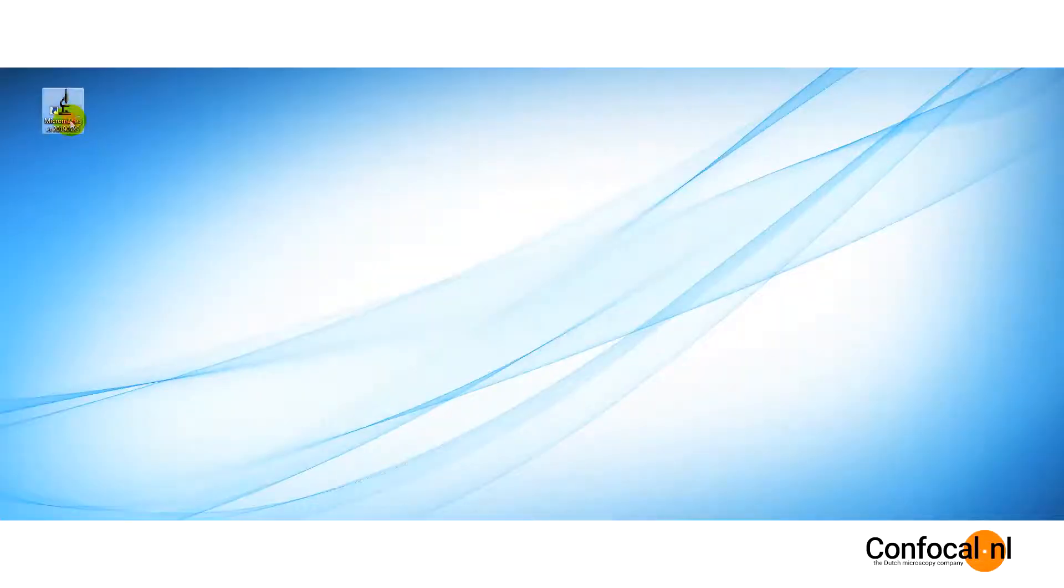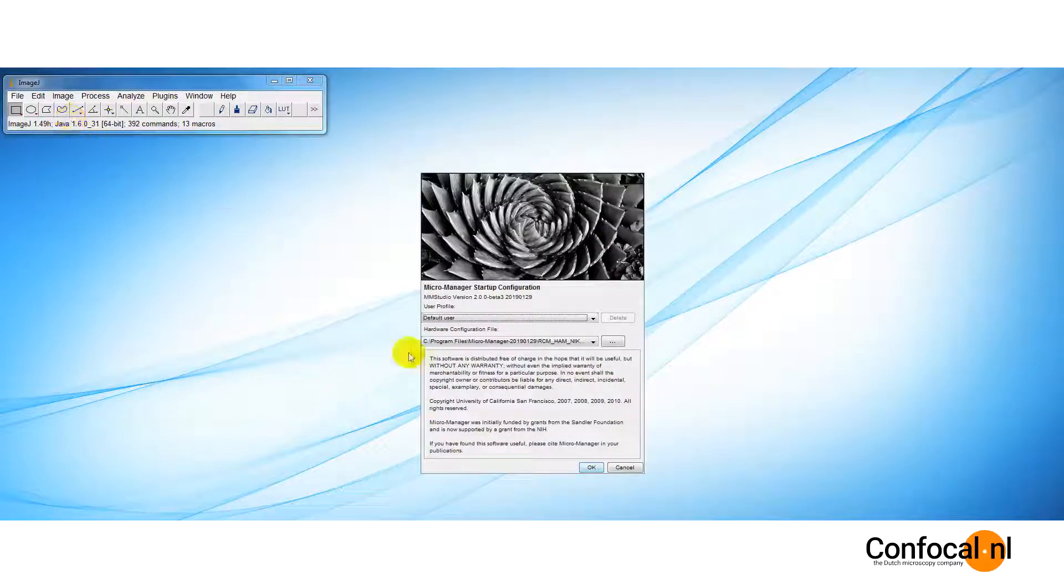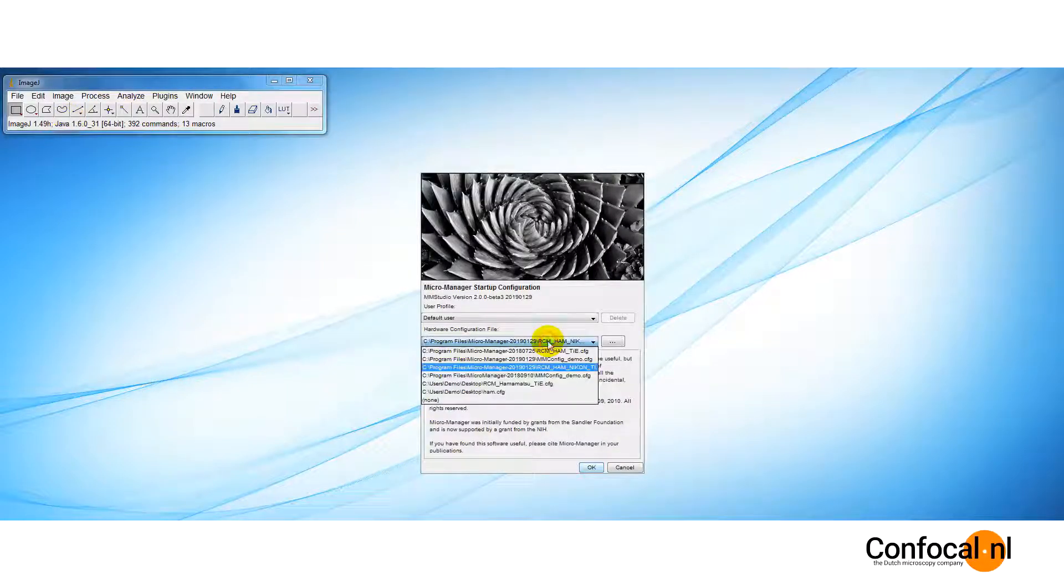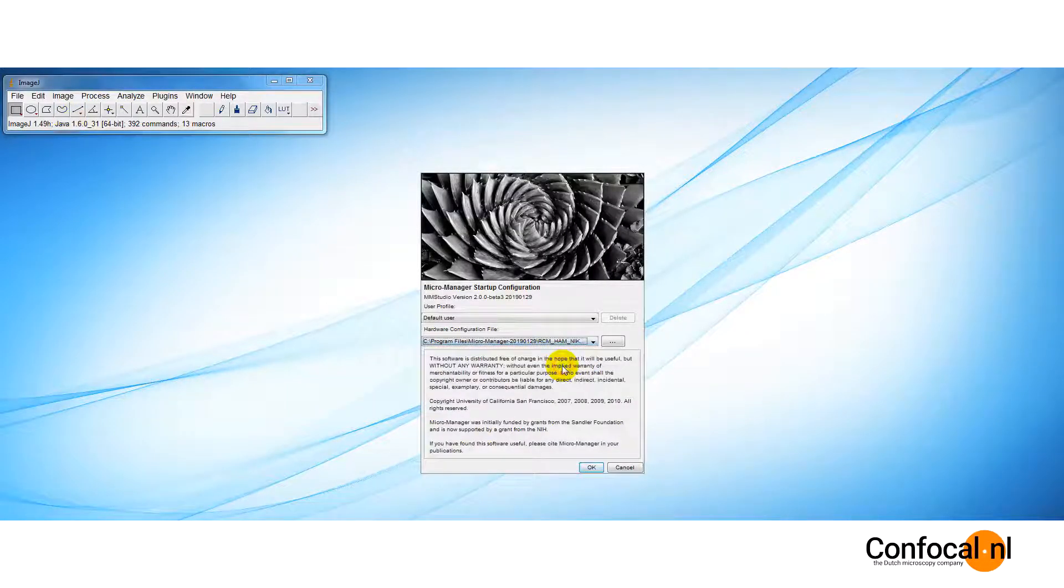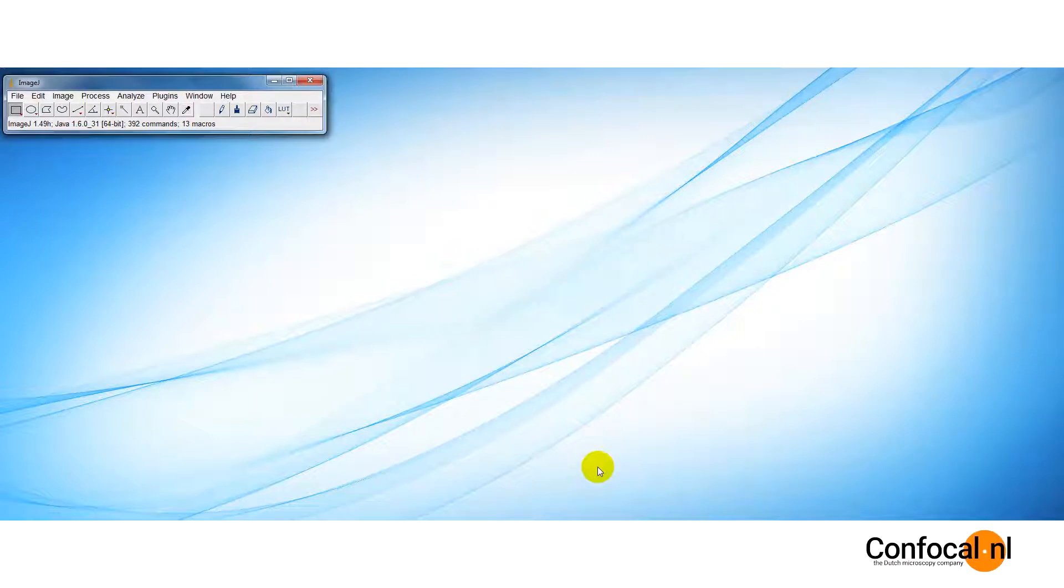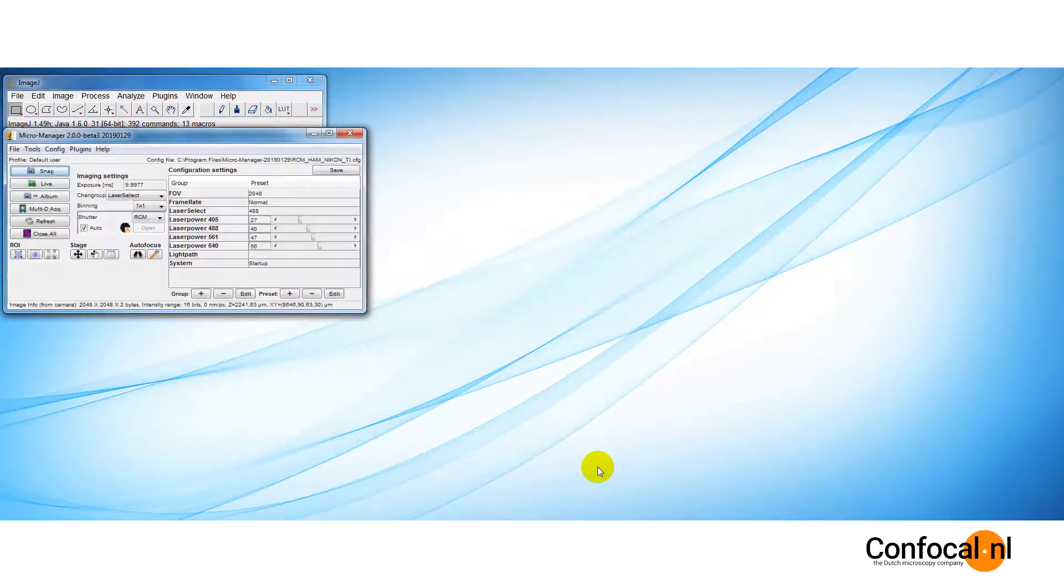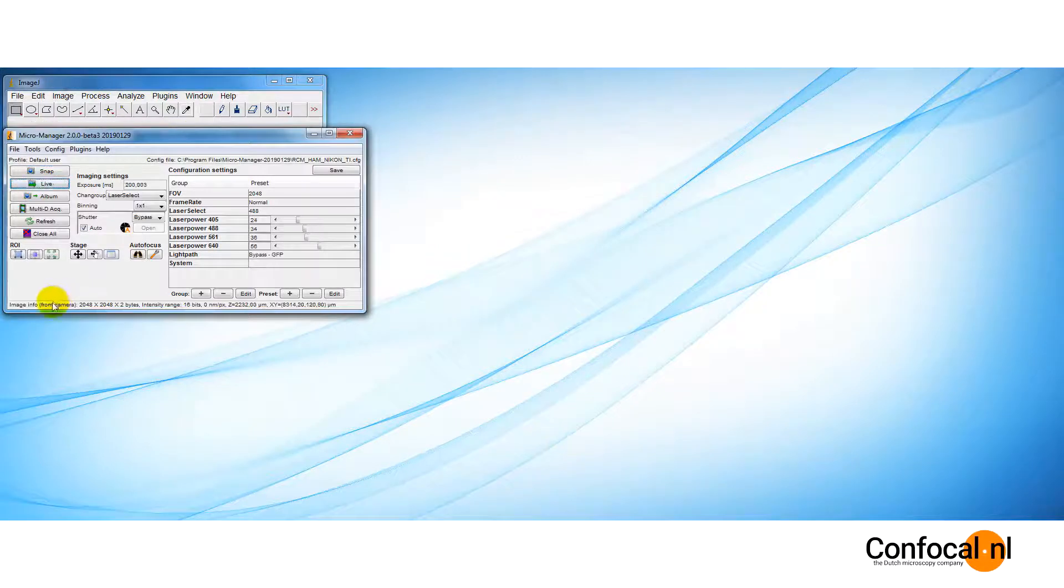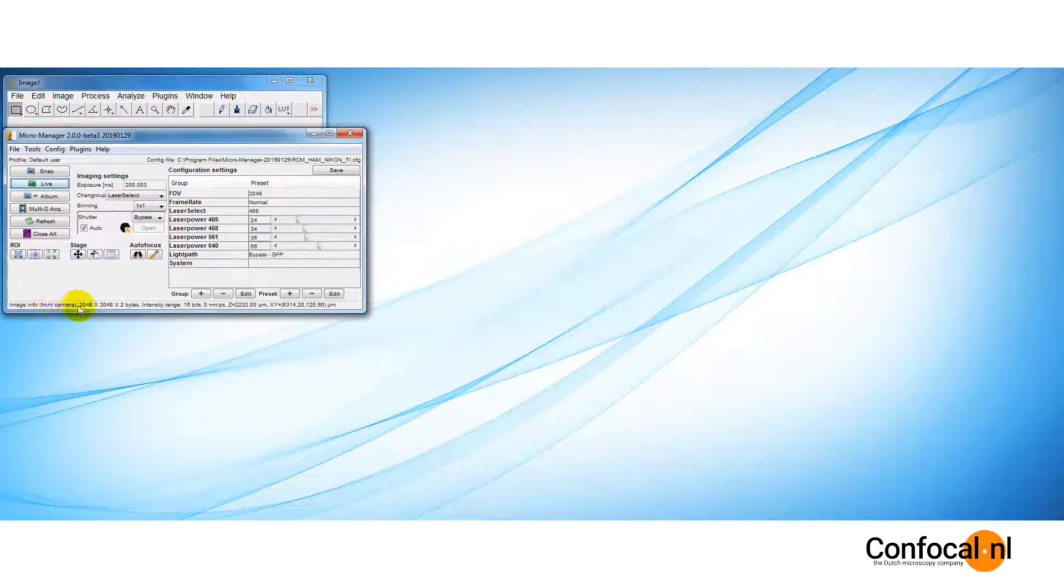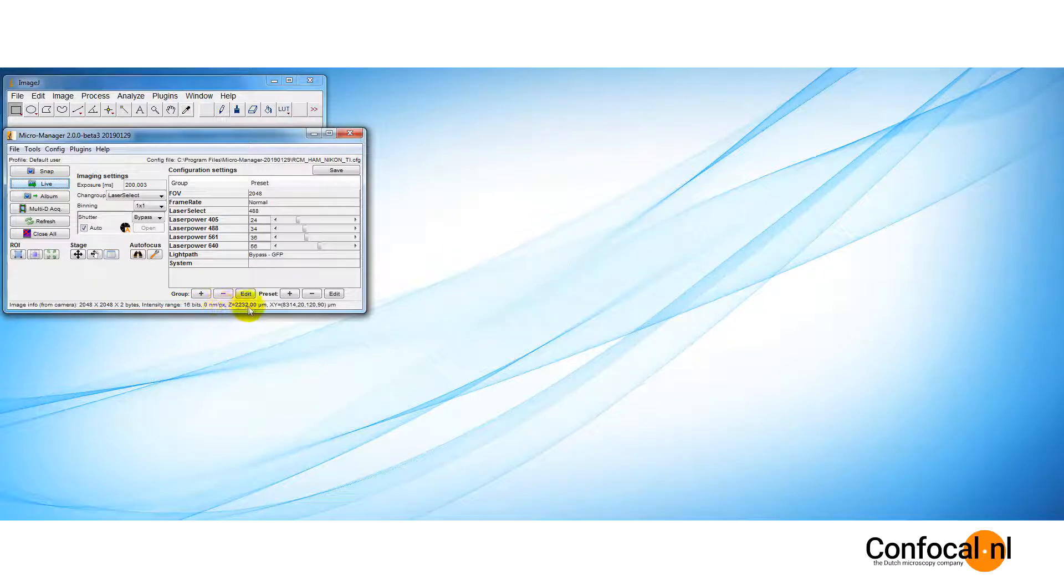To start, choose the configuration from this menu. The configuration defines the devices you will be able to control. After the configuration file is loaded, the main window displays the current settings and shows the status of selected devices. The main window for Micromanager is where you get access to all the features of Micromanager and control the RCM unit.